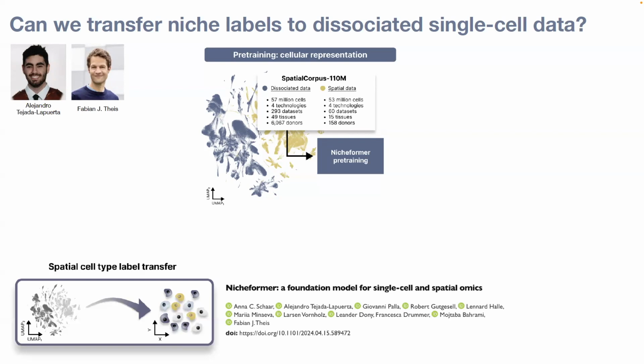You get such big data sets with Xenium, Visium, that we are already now outgrowing by a lot what is out there in single-cell RNA-seq. And that's something not even 10x is aware of. I discussed this phenomenon and they were like, interesting, we have never looked at this. And you see now there's this huge area of spatial transcriptomics, but think twice about the numbers.